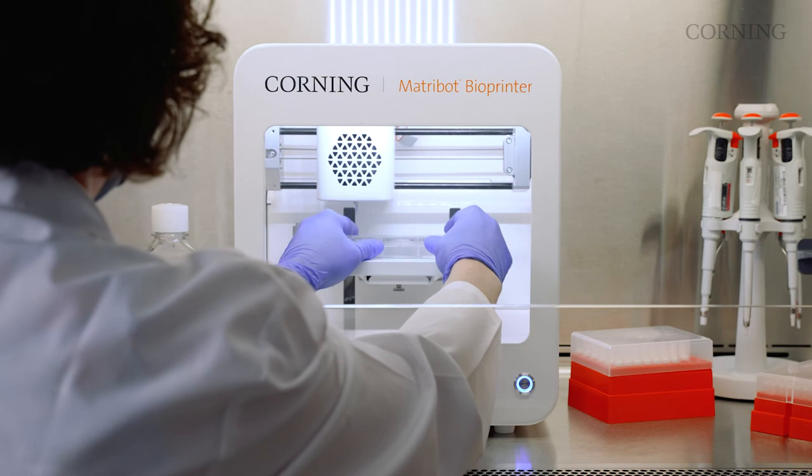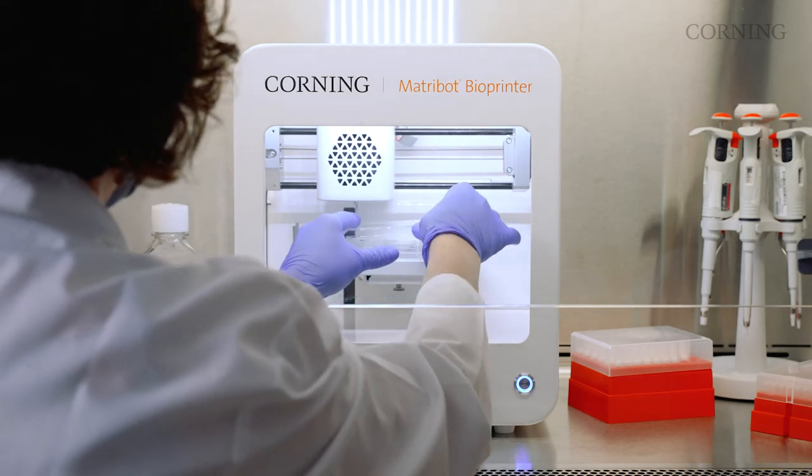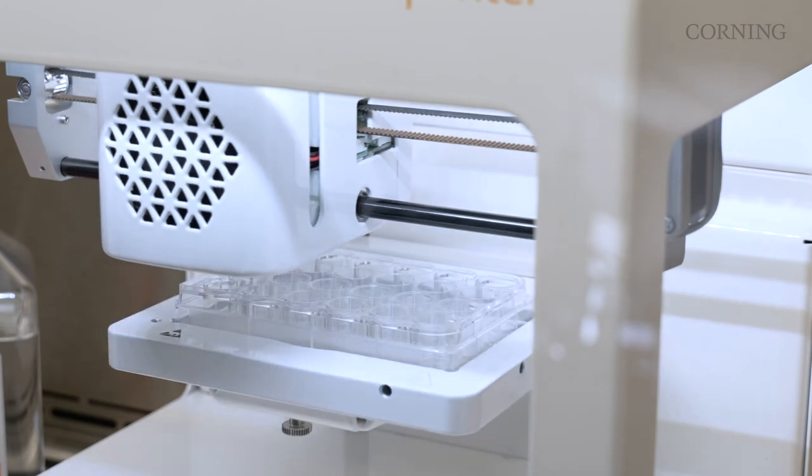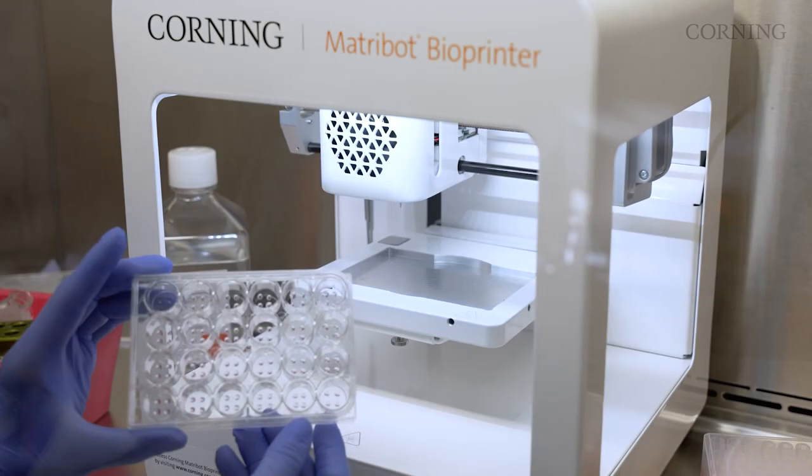Advances in 3D cell structure require advanced technology. The Corning Matrobot bioprinter enables sophisticated drug discovery and toxicology research for future personalized therapeutics.